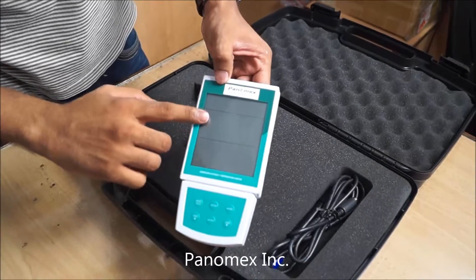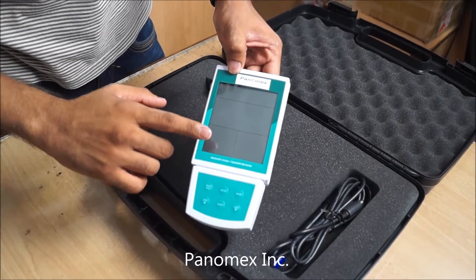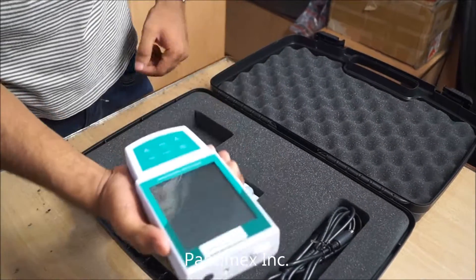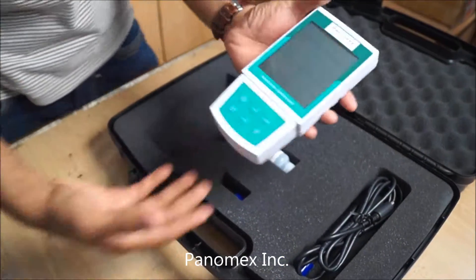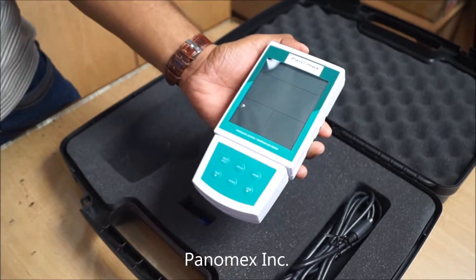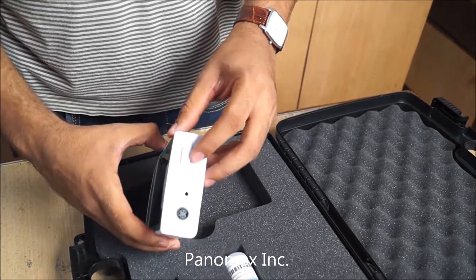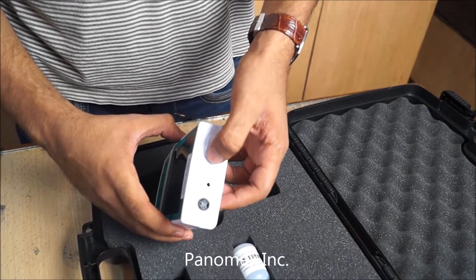This DO meter is portable and handheld. It can be easily held with your palm like this. This is the on/off switch — slide it like this.